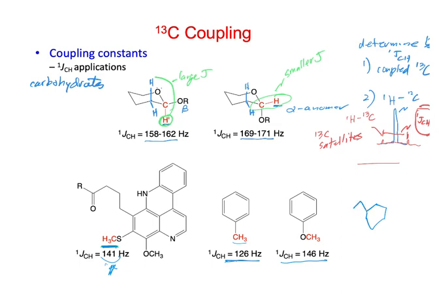So I used these compounds so I could put some other substituents on here. OCH3 and CH3. And this said that this one would be at about 11.9 chemical shift.